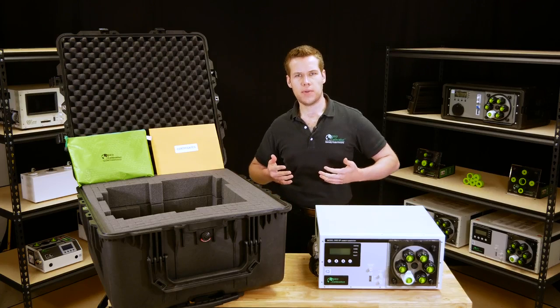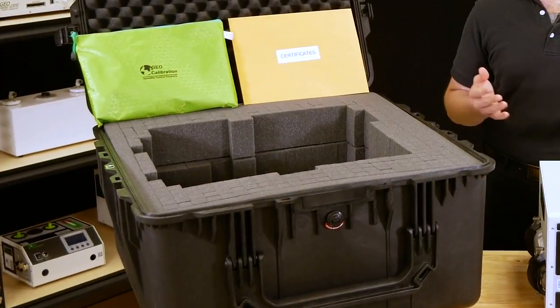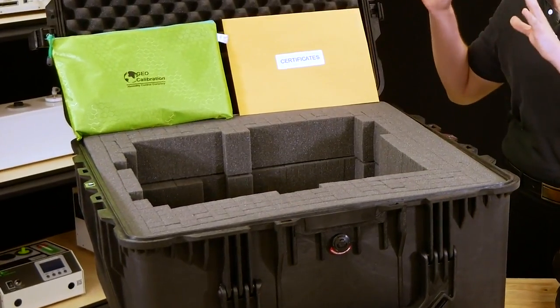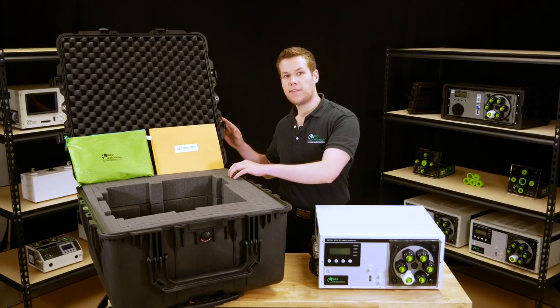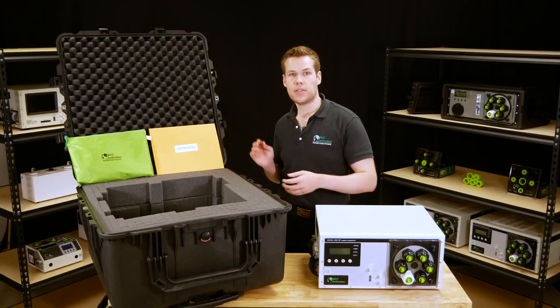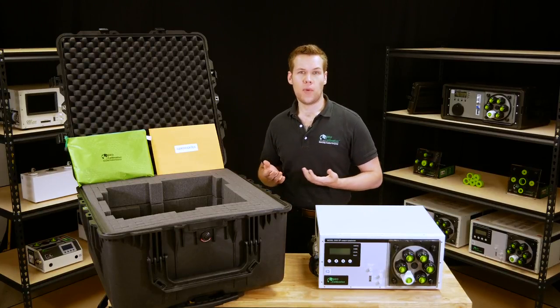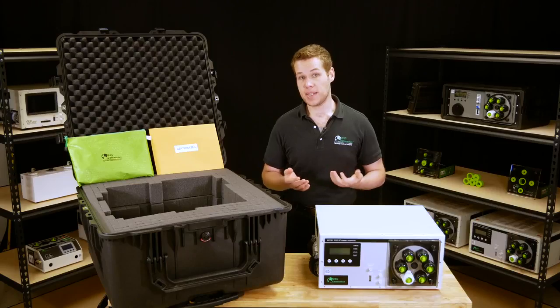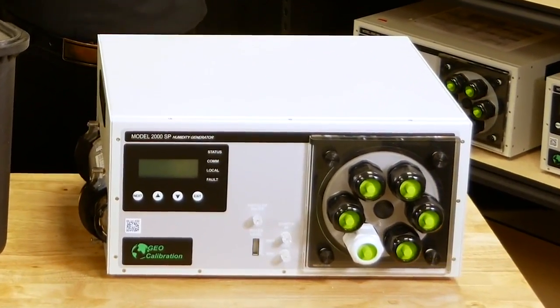The first thing you want to do when you receive your unit is examine it for any shipping damage. As of 2018, we ship all Model 2000 SPs in this ruggedized hard plastic case. You can see that the interior is made of a nice foam which is specifically cut to prevent damage to the unit during shipping. Even with all of these protections, we all know that the carriers can sometimes be a little rough, so do a thorough inspection for any bends, breaks, or dents.